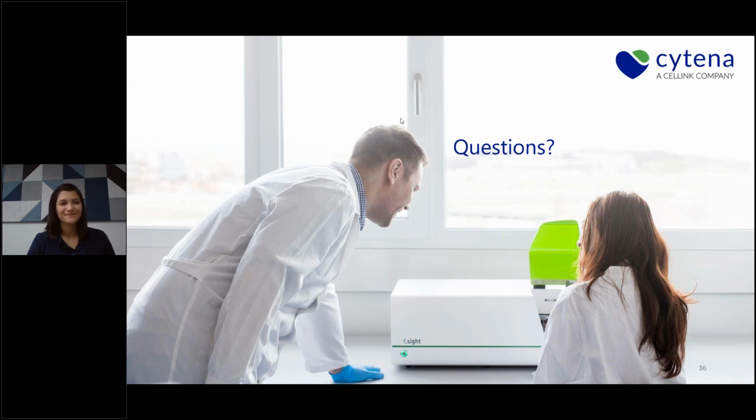Can the instrument recognize and remove any dead cells or damaged cells, or how do you remove them? Again, this starts with the right protocol, because you can get rid of many dead cells if you prepare your sample the right way. And because you have all the images from the C.SIGHT, you can see the condition of your cells.